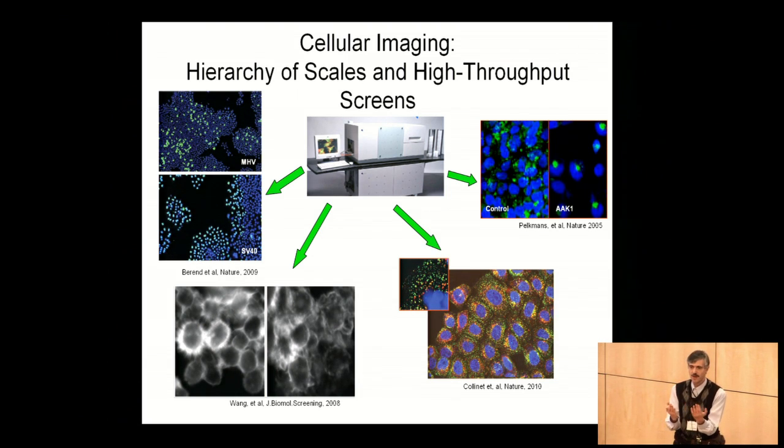If you just see them one by one, you can't say, is it brighter or not brighter? Our eye is very adaptive. You see the same color, and you see it a second time, and you don't see the same color. It depends on what you looked at before. So we are very adaptive. In this case, we have to go to something more reliable and more quantitative.